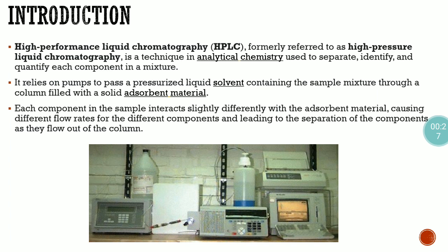High performance liquid chromatography, HPLC, formerly referred to as high pressure liquid chromatography, is a technique in analytical chemistry used to separate, identify and quantify each component in a mixture. It relies on pumps to pass a pressurized liquid solvent containing the sample mixture through a column filled with a solid adsorbent material. Each component in the sample interacts slightly differently with the adsorbent material, causing different flow rates for the different components and leading to the separation of the components as they flow out of the column.